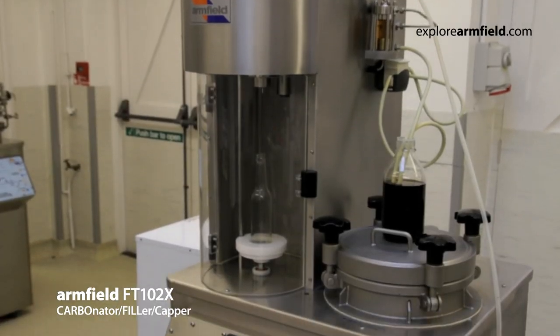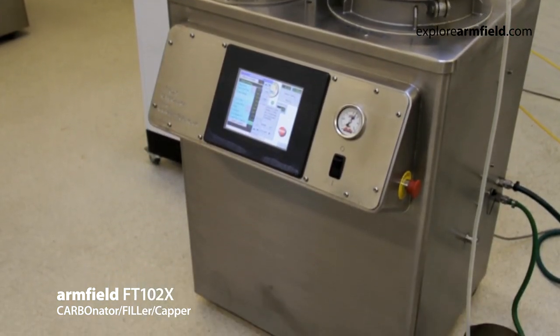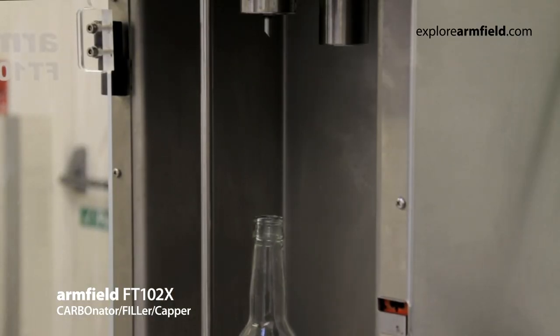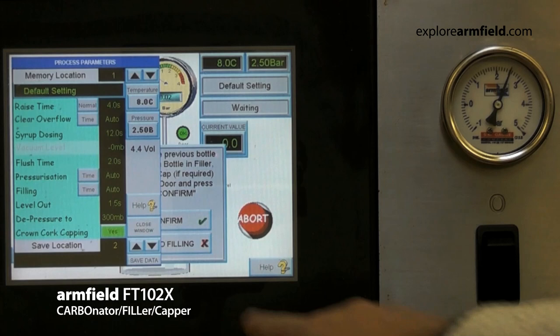Introducing the Armfield FT-102X Carbonator Filler Capper. This video presentation demonstrates a typical post-mix carbonation syrup dosing, prior to the filling and capping cycle.